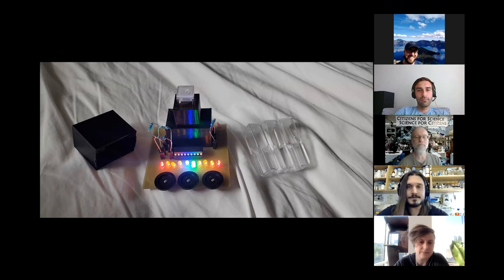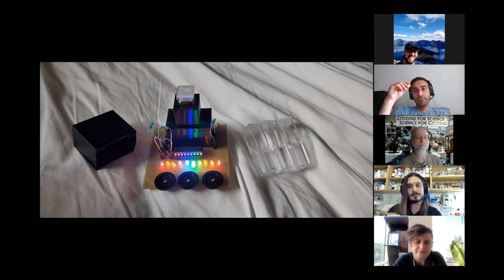So here's a project that just started not too long ago. I call it the Better Than Nothing Turbidoscope. A lot of folks have done really wonderful work using 555 timers and Arduinos to make basic turbidity meters, like spectrophotometers fixed at 600 nanometers. I decided to harken back to the good old days of the 80s and use a chip that drives LEDs, like a decade counter. It basically splits a voltage into 10 and lights an LED for every step along that voltage.